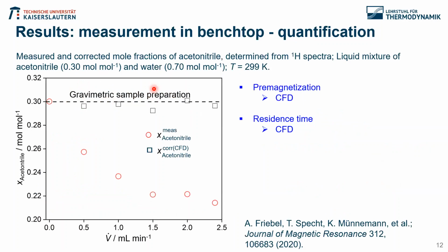Still, the quantification for getting the concentration of the different molecular species is quite difficult when you do hyperpolarization, and especially if you do ODNP.